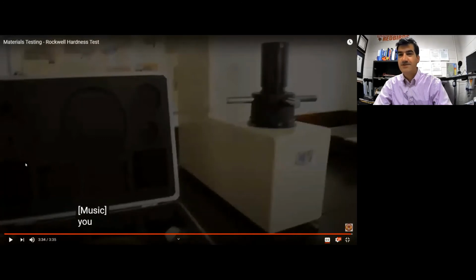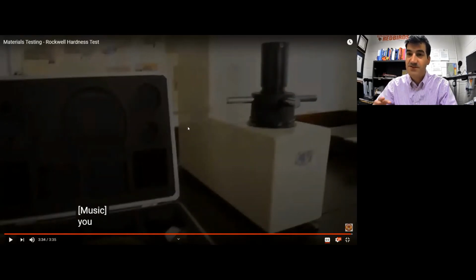All right, you can tell those subtitles were automatically generated because they mix some things up, but I still think it's probably useful for you because I don't know how good the audio is carrying over to the microphone. So the subtitles might have been kind of useful for you, but there were a few errors in there. I tried to point out some of them as they were coming across. Maybe the guy's British accent was throwing off the subtitles. All right, hopefully that video was kind of helpful and it gave you a demonstration of the manual Rockwell hardness testing machine.